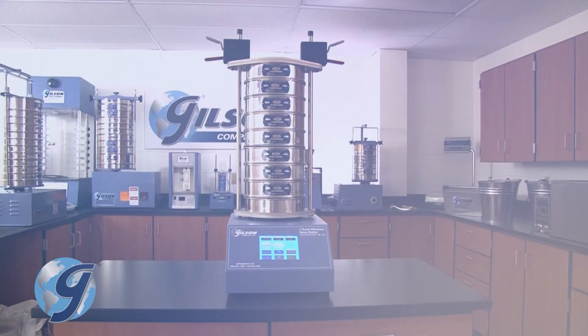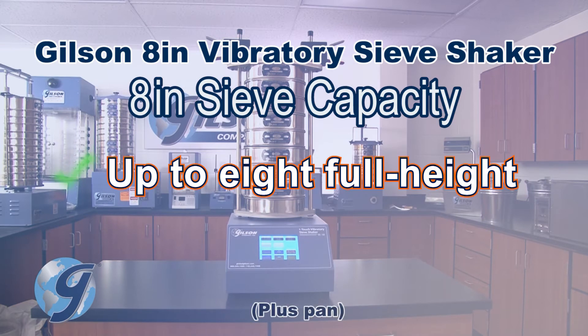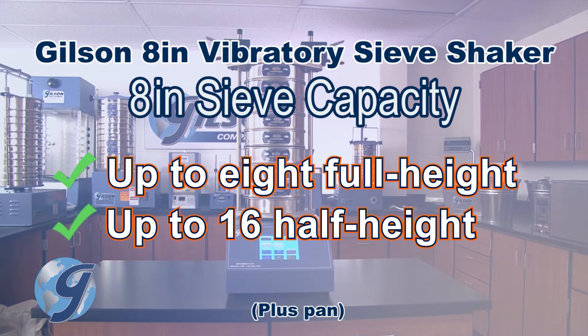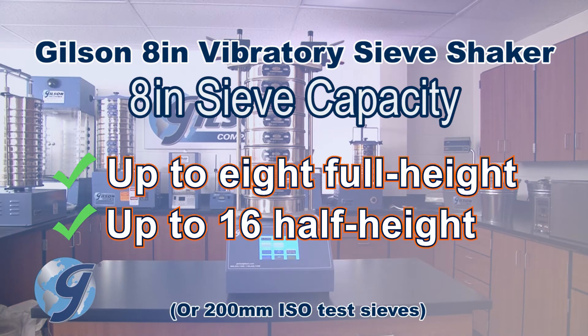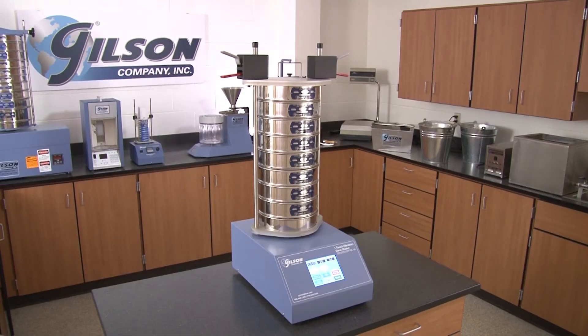With a recommended particle size range from number 10 to number 635, the SS10 accepts up to 8 full-height or 16 half-height ASTM 8-inch or ISO 200-millimeter test sieves, and is the perfect choice for your materials testing lab.